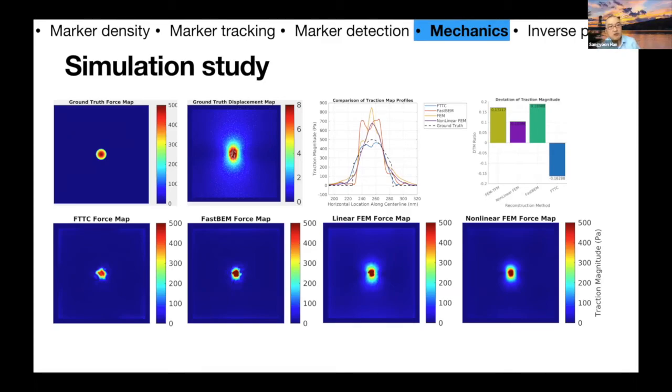It depends on the level of the deformation, definitely. The gel we are using is about 14 microns thick. I don't know about your coating, but if it's less than 1 micron thick, then I don't think there will be deformation we can observe visually.